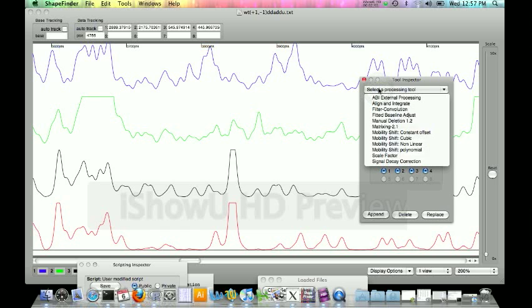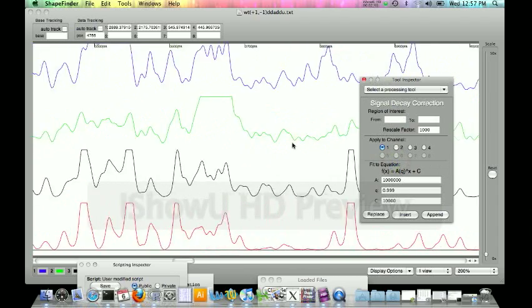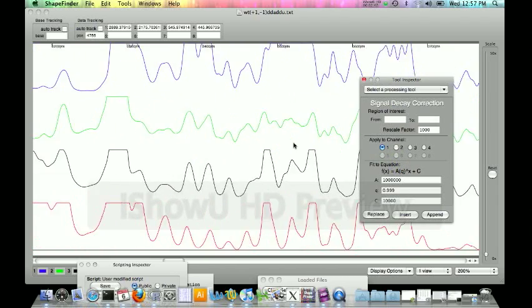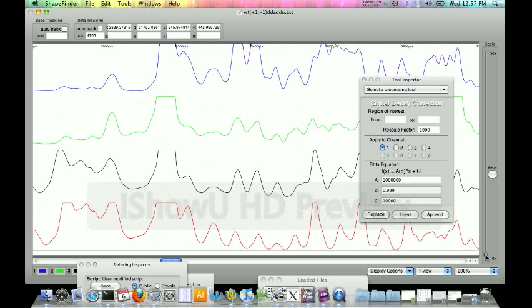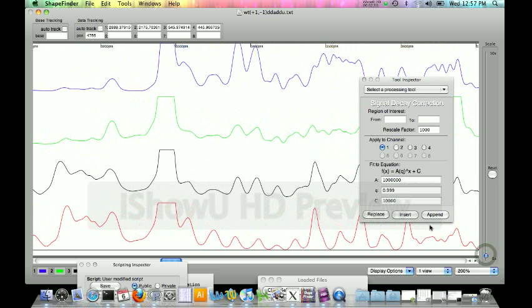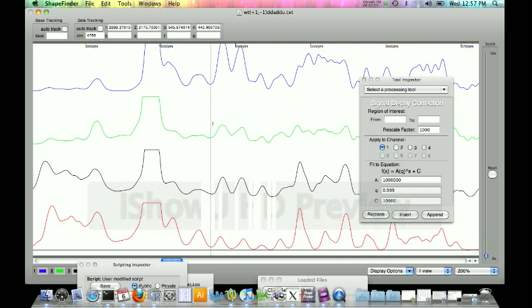The next step we're going to choose is signal decay correction which helps adjust for scaling issues that can happen when your data comes out of the CEQ. It basically will put them all in the same frame. What you want to do is choose a range of your data where you have a good amount of data but it's also not including your RT peak.